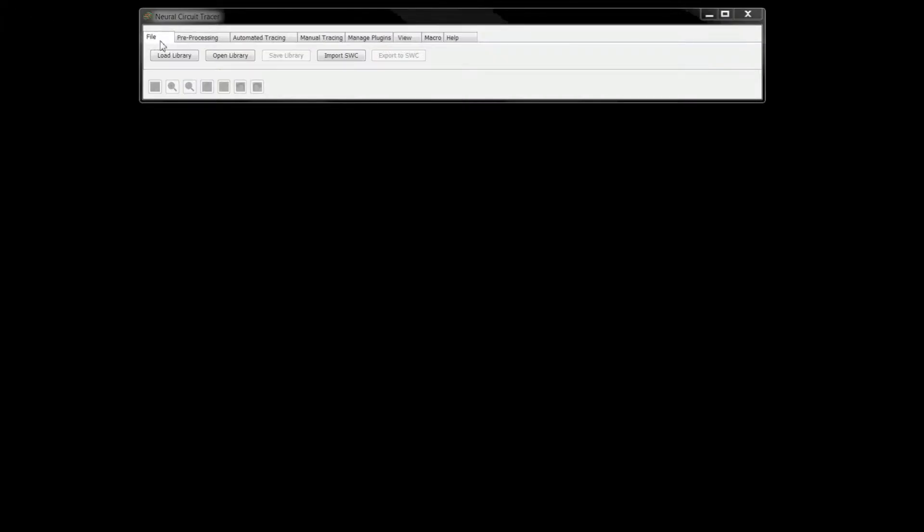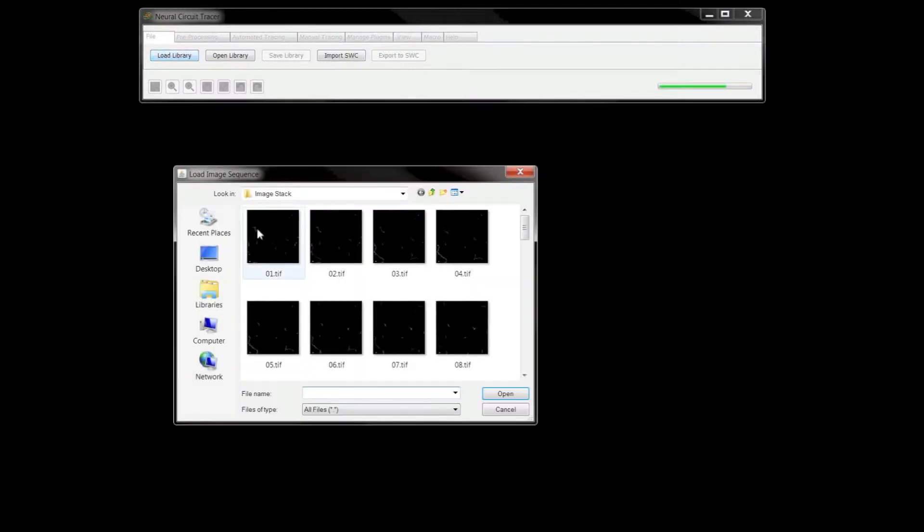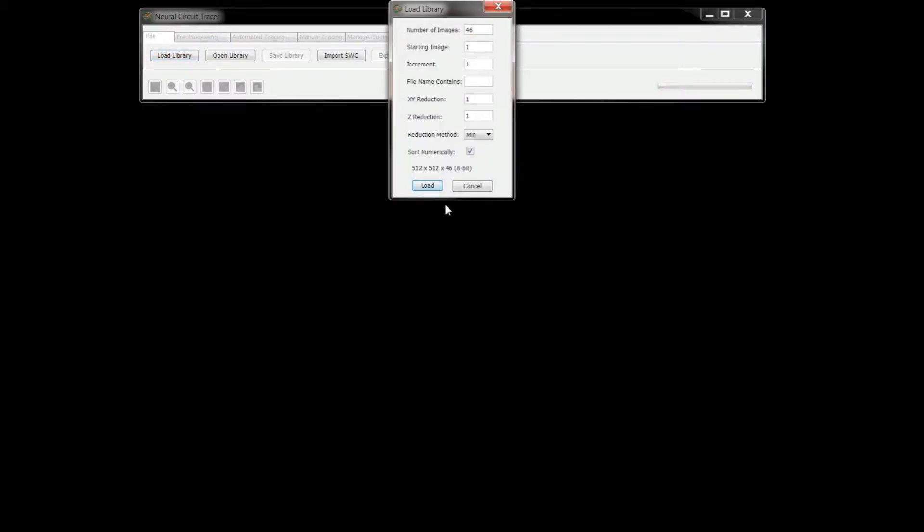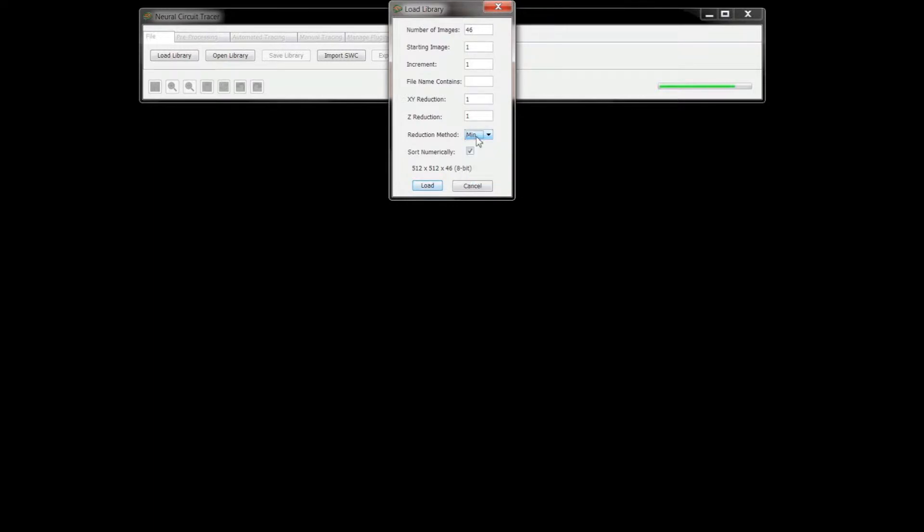The File tab allows you to load an image stack. Neural Circuit Tracer supports many different image types. Loading options include operations to limit the number of images loaded from the stack and criteria-based reduction of the image resolution.